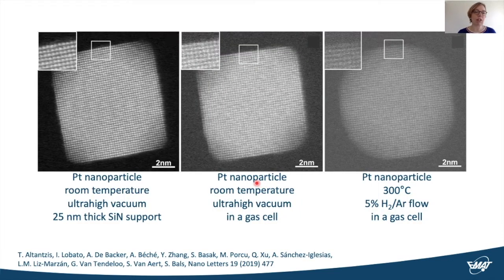This methodology of retrieving the 3D atomic structure from a single image opens up new prospects for analyzing in situ experiments. However, applying a similar methodology for images acquired in a gas environment is far from straightforward, because the signal-to-noise ratio and contrast get significantly worse when imaging particles in a gas cell and in the flow of a selected gas, as shown here. Moreover, those images have been acquired at high speed, with a scan time of only 1 second for each frame, resulting in kilohertz up to megahertz frequency distortions, which are very strong and often highly correlated along the fast scan direction.